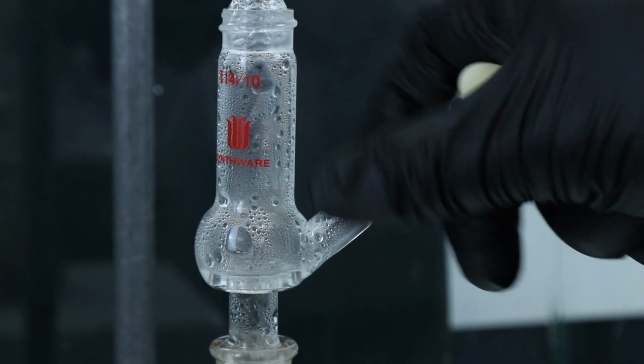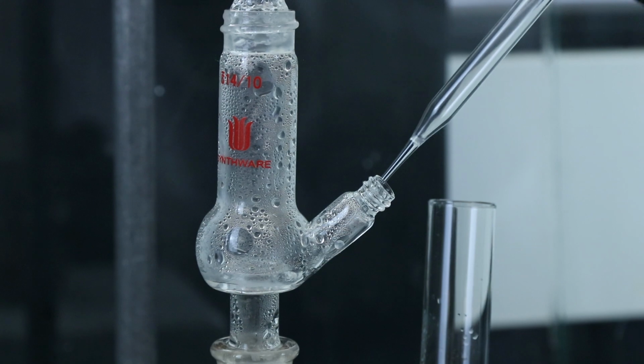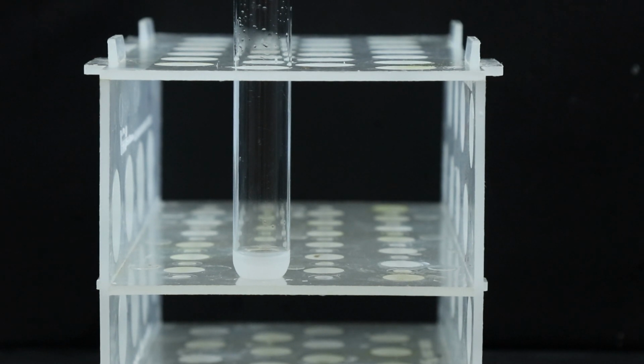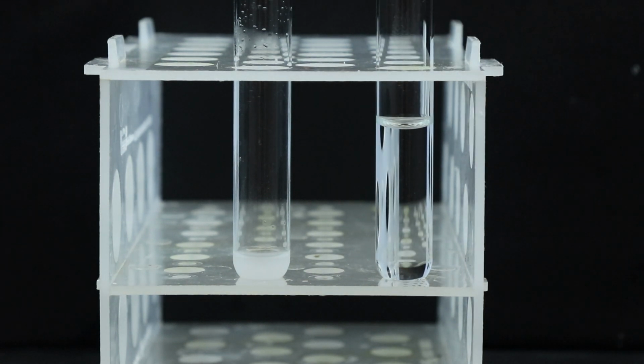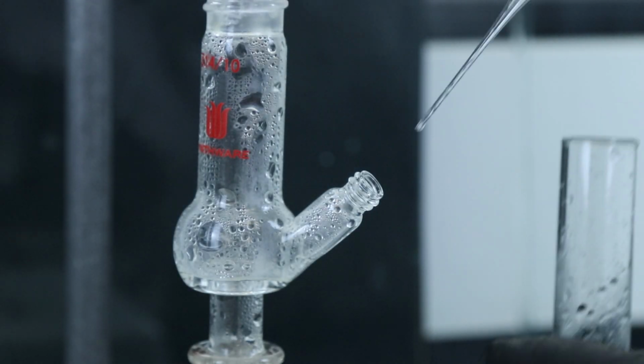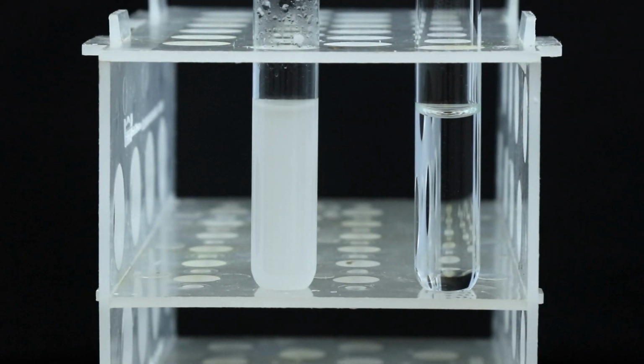It looks like enough distillate has gathered in the Hickman still now, so I'm going to go ahead and start removing it and transfer it over to a test tube. I'm going to keep doing this until I've gathered 5 to 7 milliliters of the distillate, and I have a separate test tube filled with about 7 milliliters of water as a reference, so I'll keep going until it matches that. After doing this about 8 or 9 times over 20 minutes, I think I'm on the last one and it should match up with the water level.